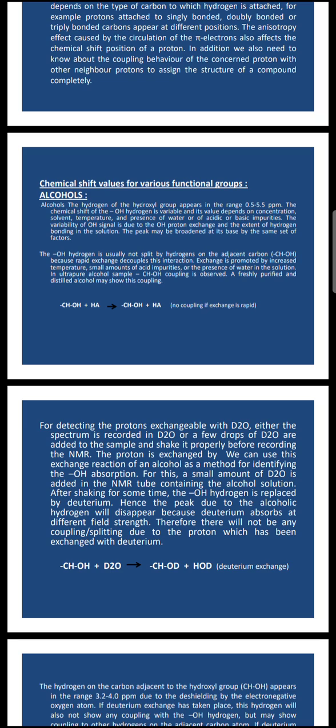Exchange is promoted by increased temperature, a small amount of acid impurity or the presence of water in the solution. In ultra pure alcohol sample, CH-OH coupling is observed. A freshly purified and distilled alcohol may show this coupling. CH-OH plus HA goes to CH-OH plus HA, no coupling if exchange is rapid.